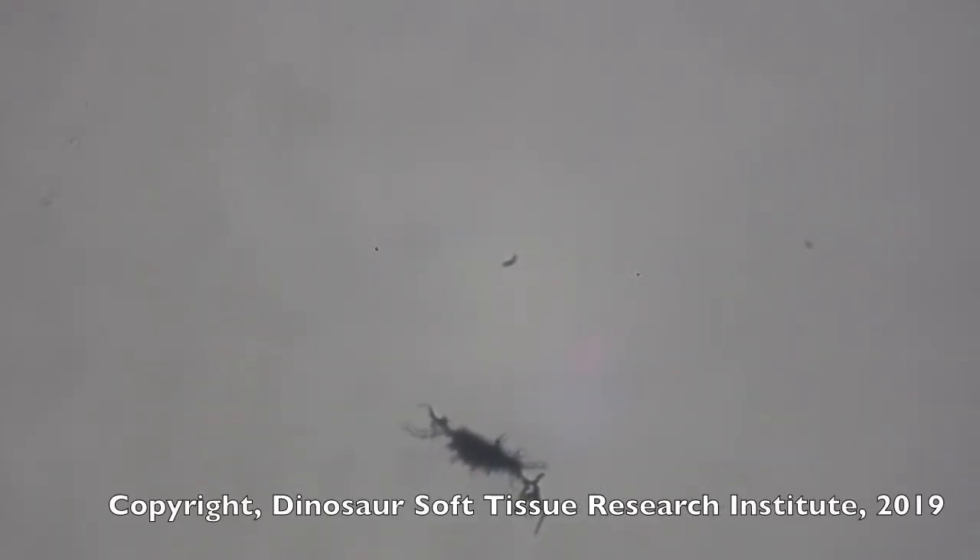Here you see a nanotyrannus cell, collected from a nanotyrannus vertebra. It's a bone cell. What I'm interested in showing you is how these filipodia are moving around. They're soft, and I'm trying to manipulate this under cover slip pressure.